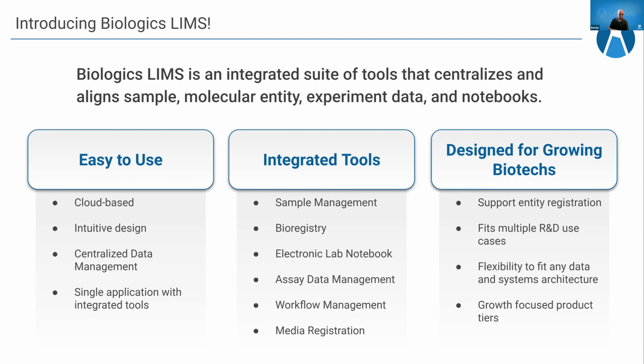If you liked what you saw, but wondered how to tie in your molecule, cell line, protein sequence data, our Biologics LIMS is that next logical step. If you're unsure, you can start with the basic functions you need now and upgrade seamlessly as you scale.